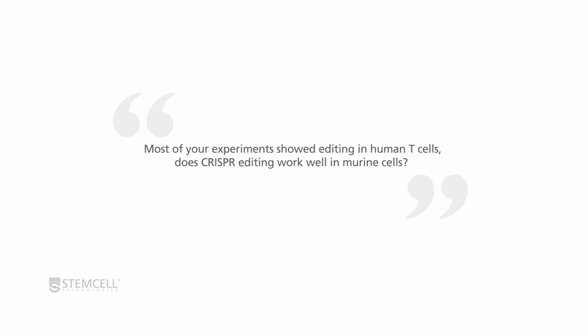Most of your experiments showed editing in human T cells. Does CRISPR editing perform similarly well in murine cells? I would assume so. Looking at the literature and going to different meetings, it seems like CRISPR works quite well across all cell types.